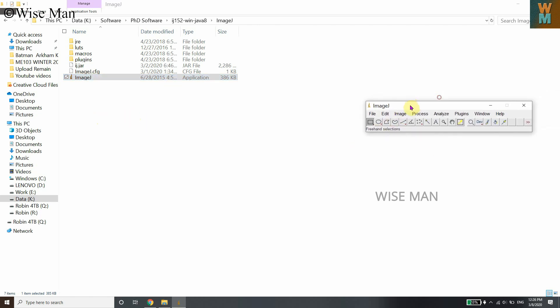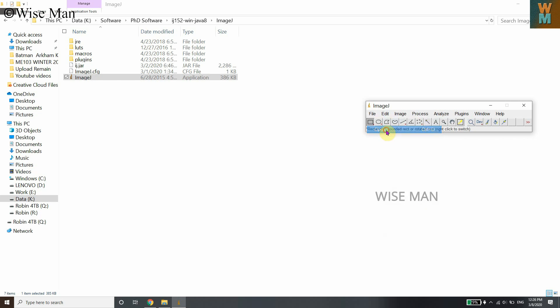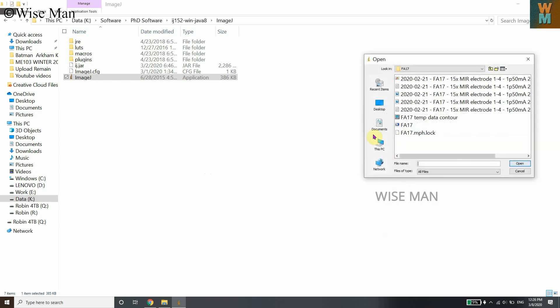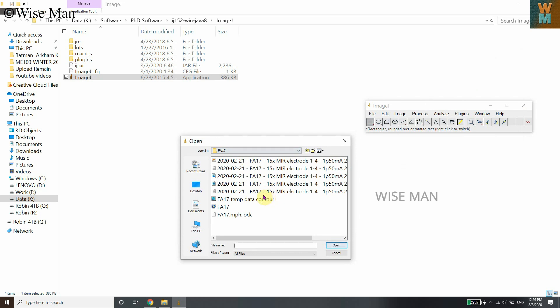Double-click the ImageJ application and you'll get a dialog box showing the main menu options: File, Edit, Image, Process, Analyze, Plugins, Windows, and Help. In this video, I'm going to show you how to measure distances in an SEM image. To open a file, go to File and click Open.